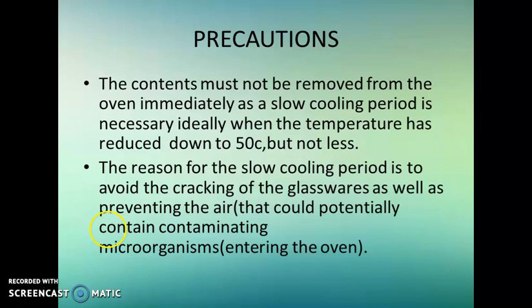The reason for the slow cooling period is to avoid what? Sometimes if we immediately open the door, cracking of the glasswares may occur, and airflow that could potentially contain contaminating microorganisms may enter the oven. So there is a chance of contamination as well as cracking of the glasswares. That's why it requires a slow cooling period, and only after that period should we open the door of the hot air oven.